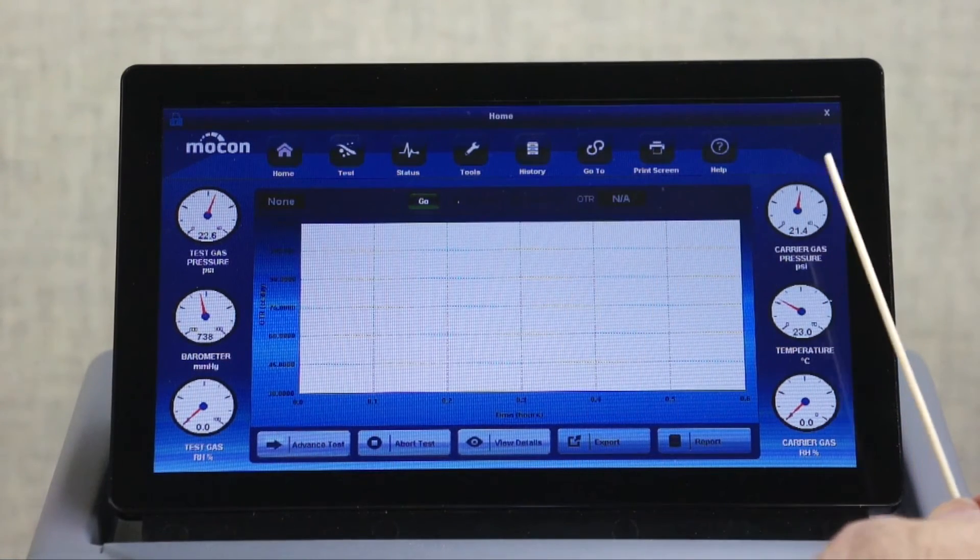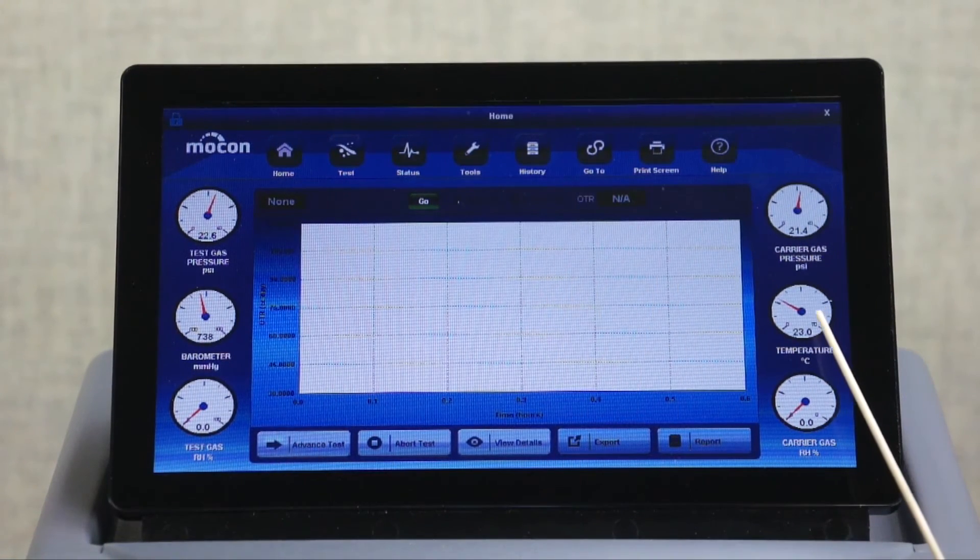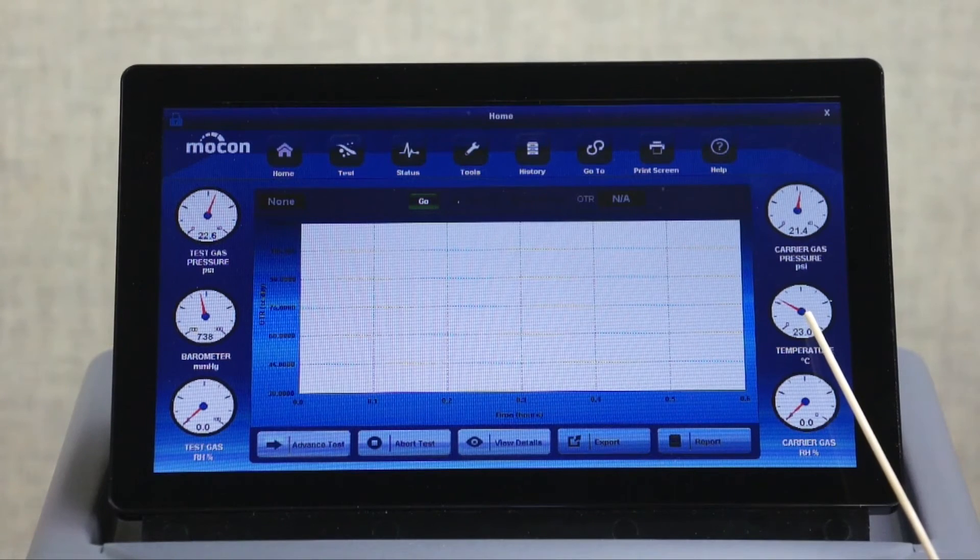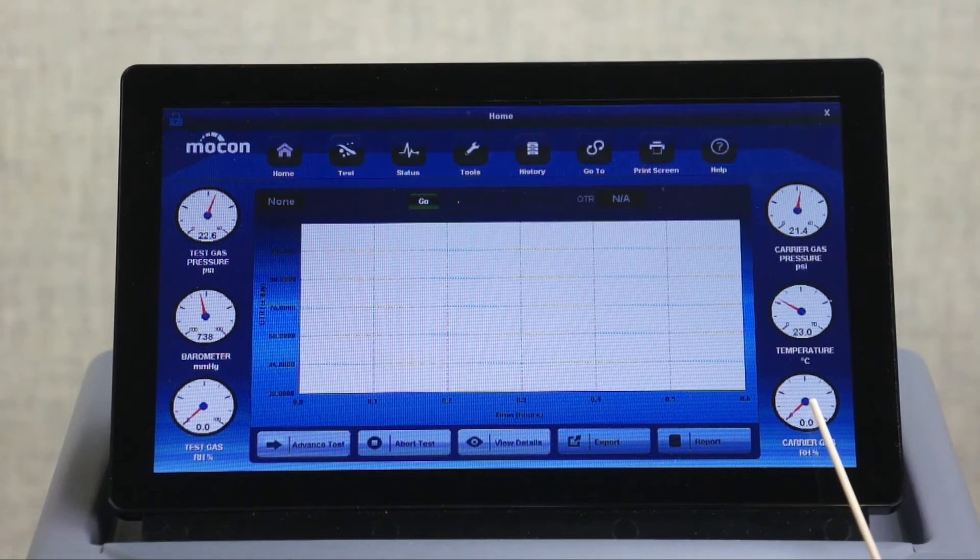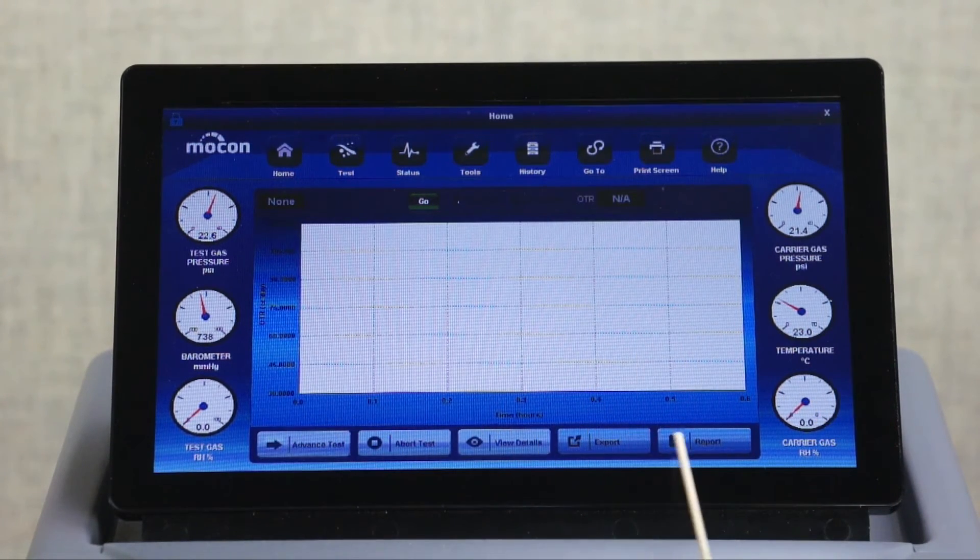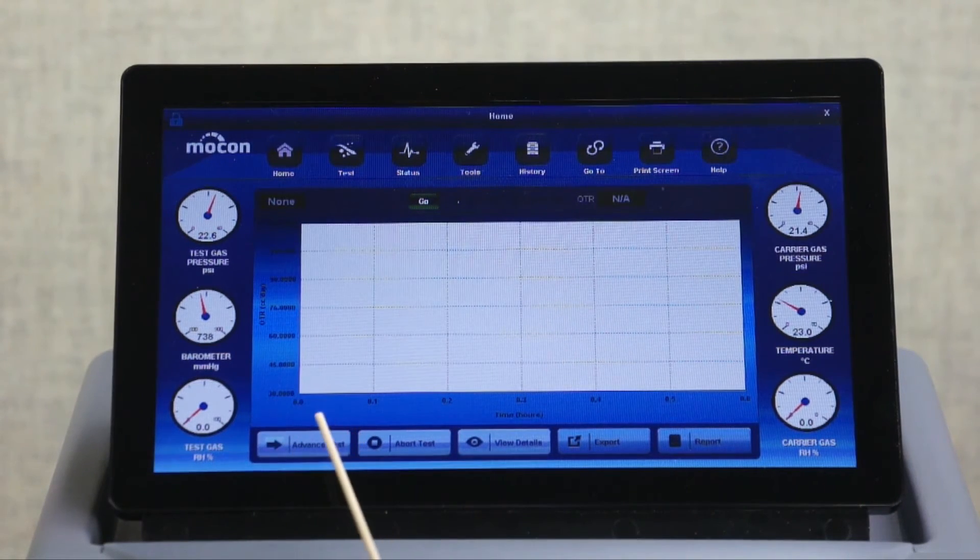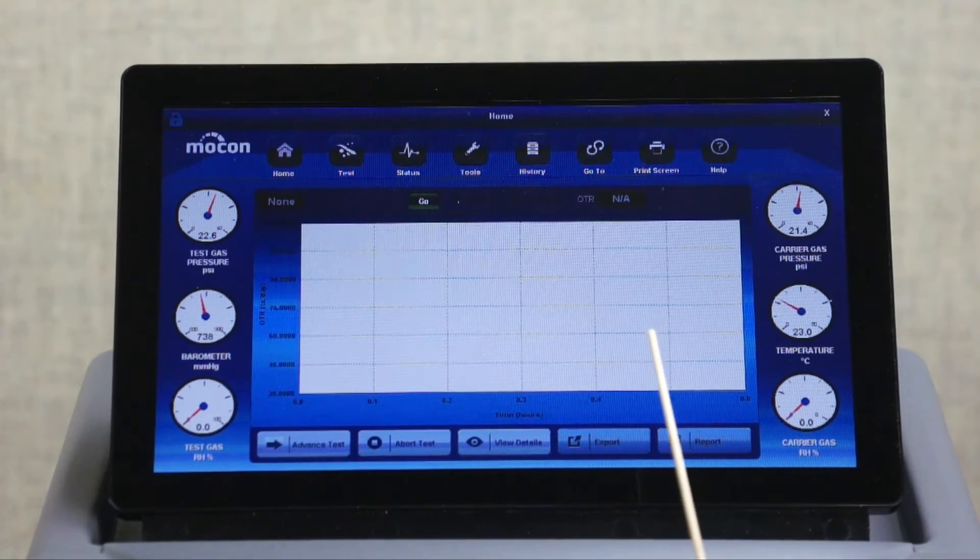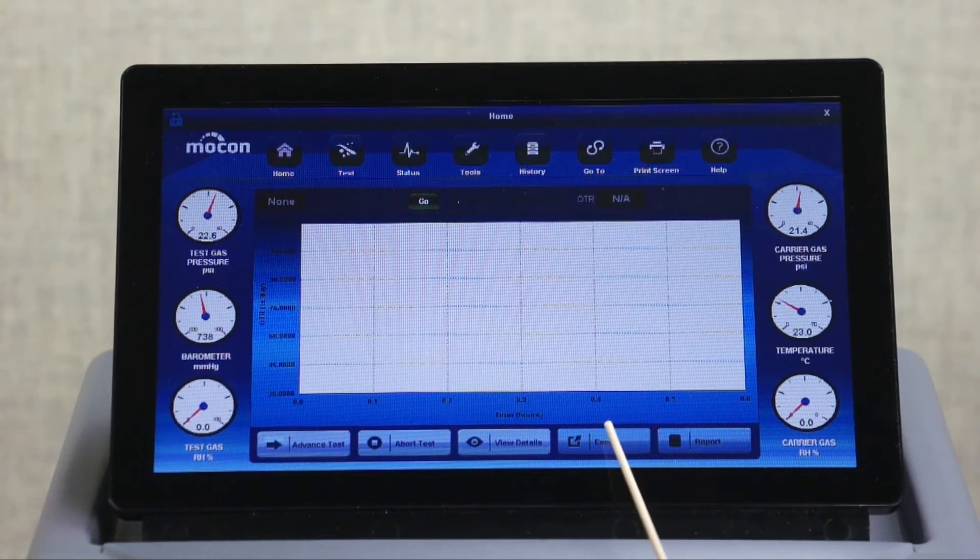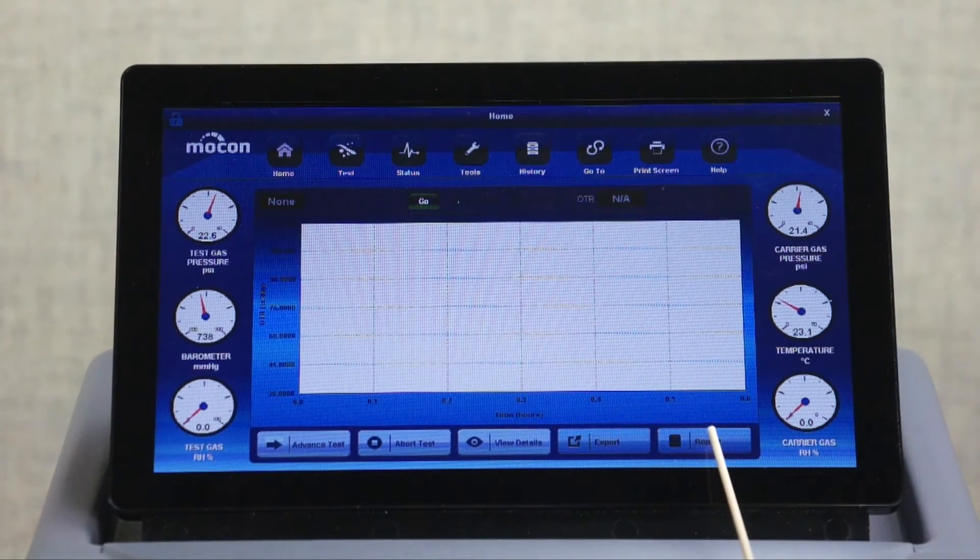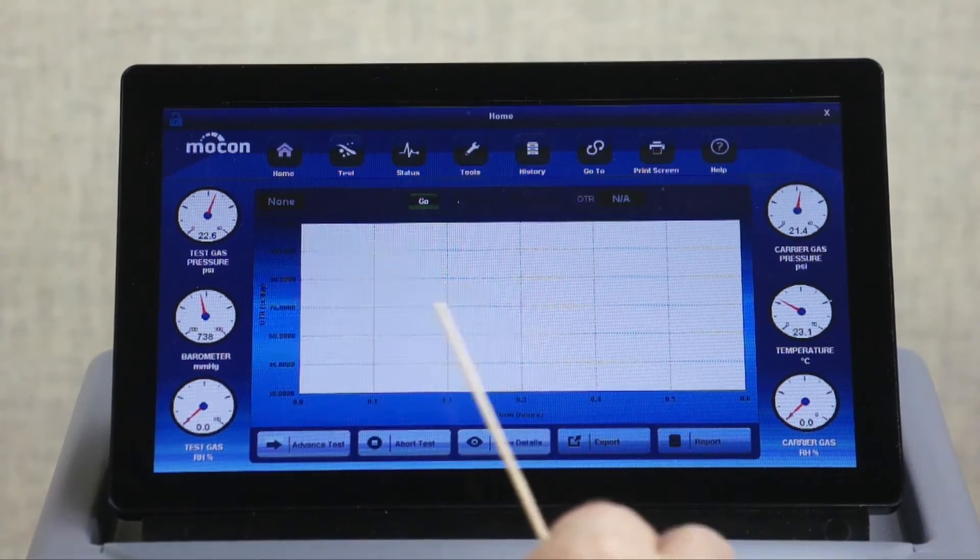On the right is carrier gas pressure, temperature, and carrier gas RH. These menus allow the operator to advance or abort the test, view test details, export, and create a report. In the middle you'll see a graph displaying the OTR readings.